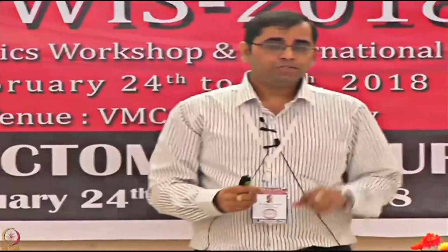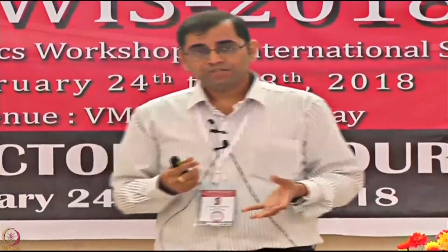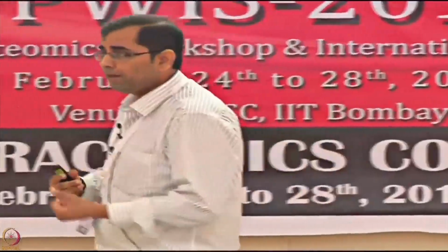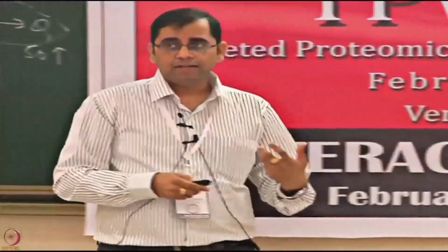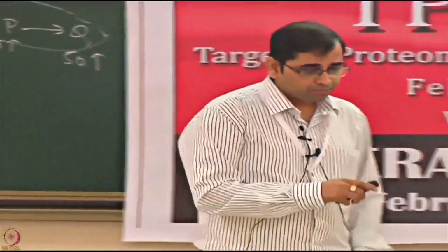But when you are talking about some of the label free platforms, you have even the ability to say that yes, binding is happening, but what the on rate is, what the off rate is, what the overall dissociation constant is for these, and how my kinetics is actually getting changed. So these are the added information on top of what you'd only obtain in the microarray based or any kind of label based platform. So that is an added advantage of the label free technologies.